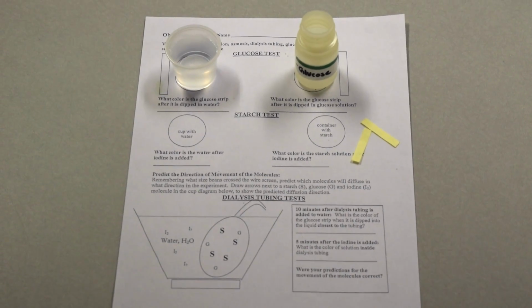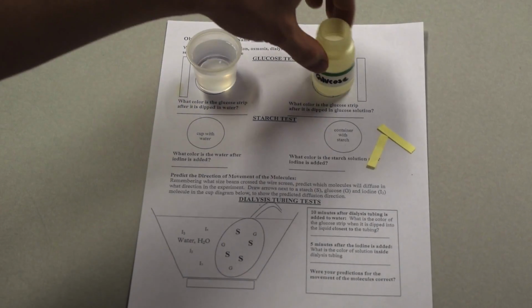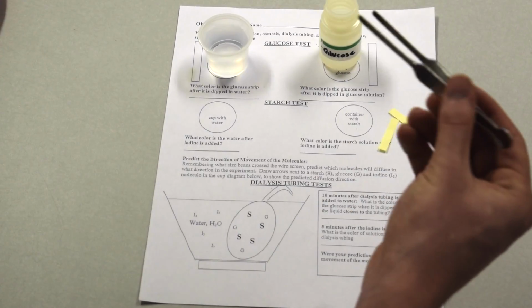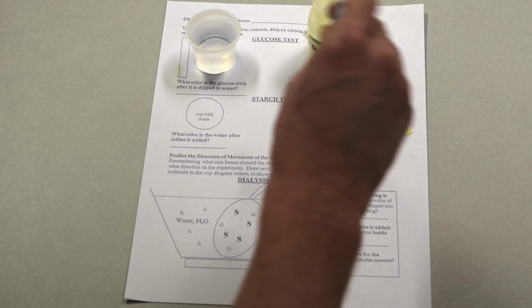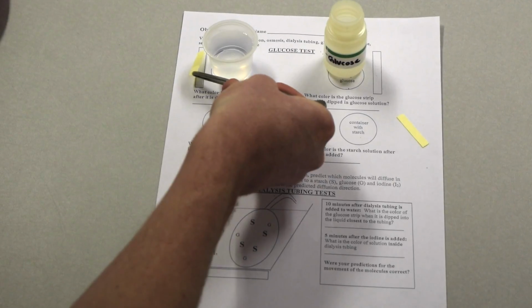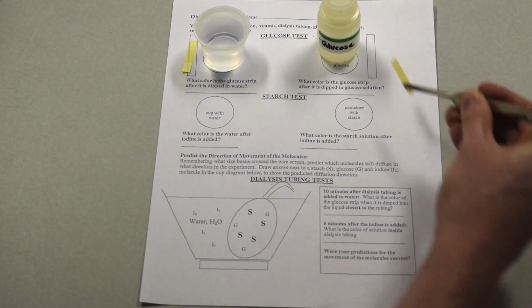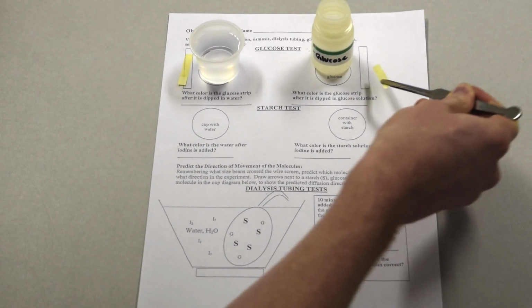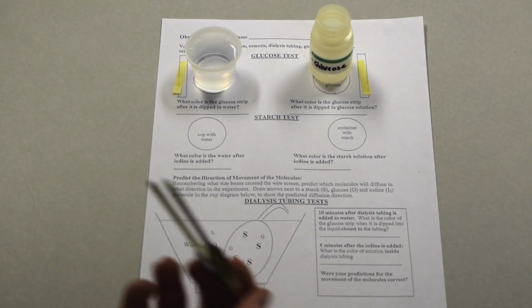Now we're going to test for glucose. Pass out to each pair of students a cup of water, a bottle of glucose, 2 glucose test strips, and a pair of tweezers. First, using the tweezers, pick up 1 glucose test strip, test the water, and we will do the same for the glucose solution. Make sure students lay down the strips in the correct rectangle.